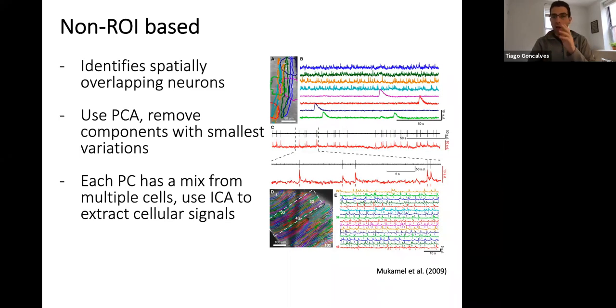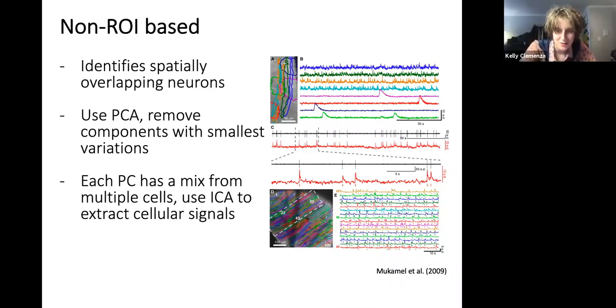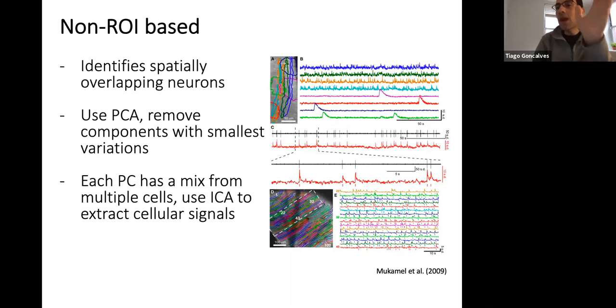So you actually solve this problem of not relying on the footprint of each cell, but you're looking at the signals and how these signals vary in time. What is the problem here? Can you guys think of any issues with this approach? What happens if you have a cell that doesn't have any firing event? Then you obviously can't tell if it's just background or not. Right. So even if you have a cell that is clearly there, that you see beautifully, structurally, but it had no firing event, you won't detect it.